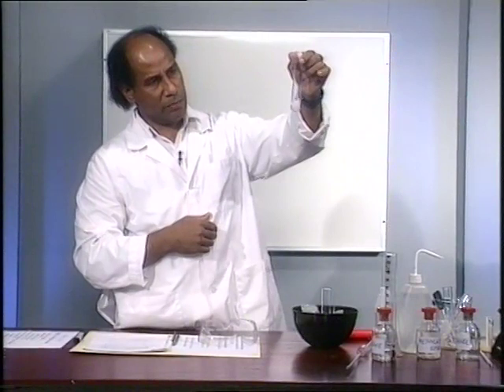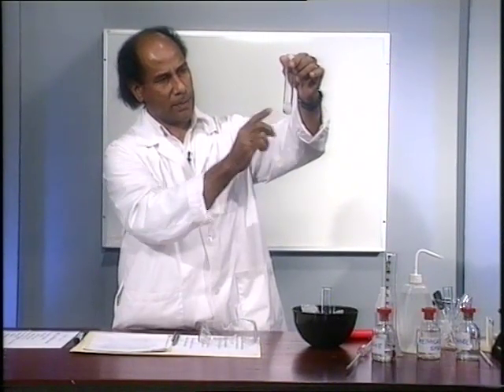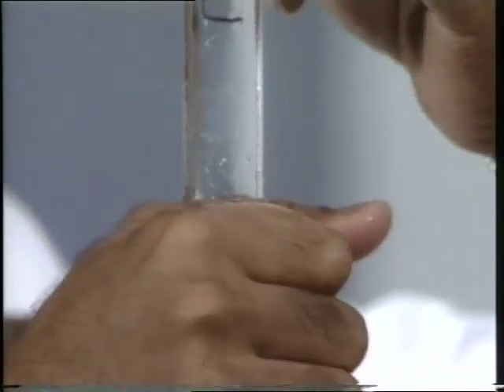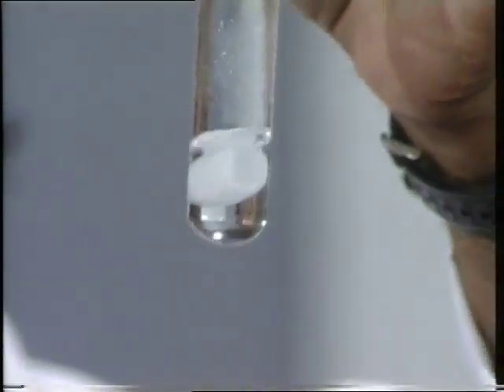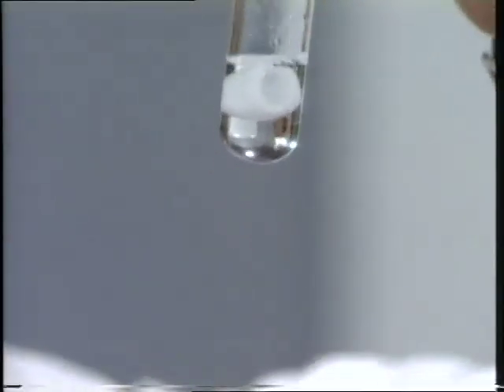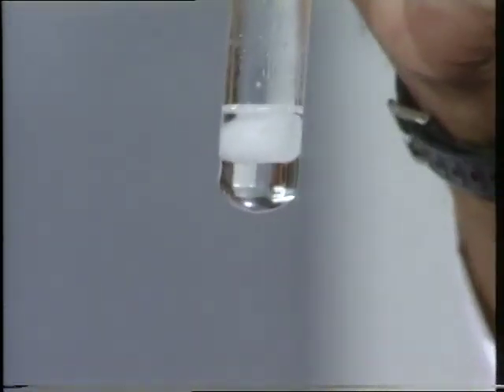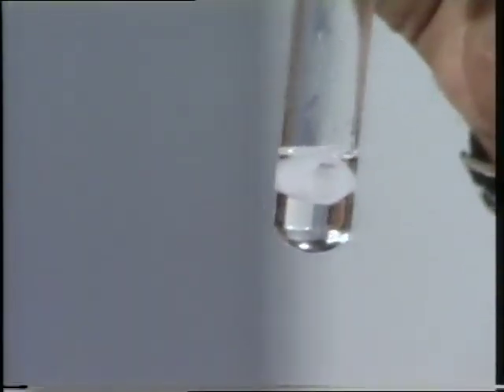Right? You can see that it's moving more freely now. You keep looking at that solid. Right? What happens to it? Now, some of you may be saying, "Oh, yeah, it is floating." Okay, it's floating. Yes, it is floating. You should also try and see why it is floating. Right? You will notice that there are bubbles coming up from the sides.